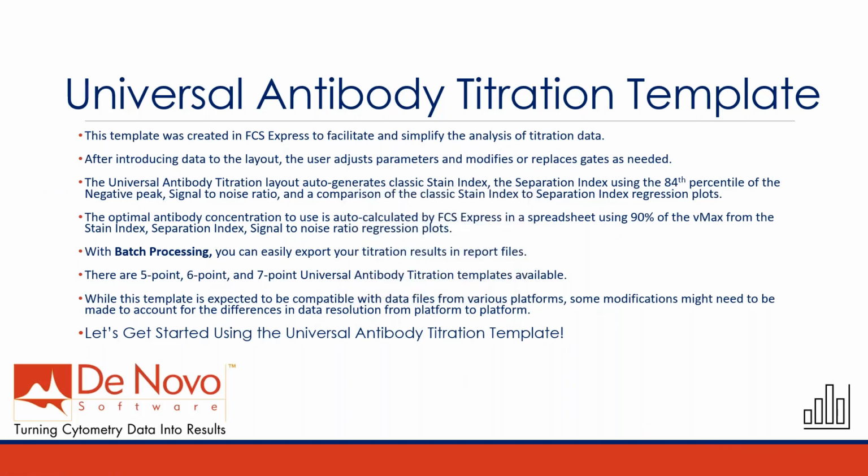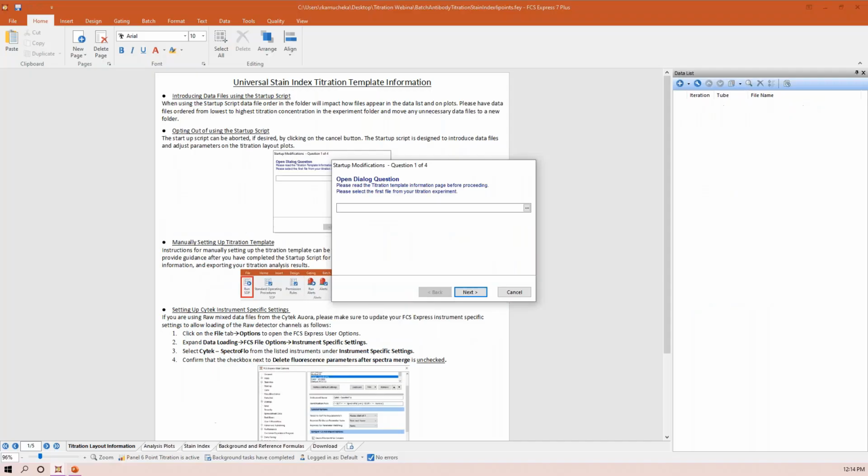And while we're waiting for this to reopen so I can show you the next step of some of the tools that are built into FCS Express, does anybody have any questions? Please feel free to put them in the question box. I'm more than happy to make sure that you guys get your questions answered during this call.